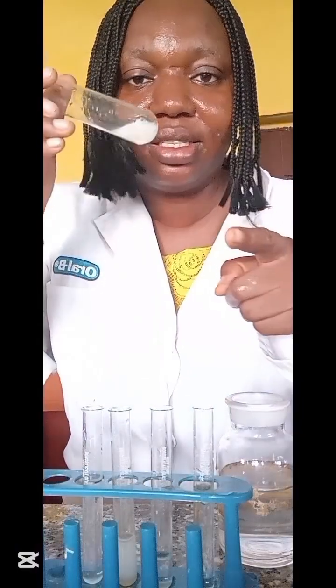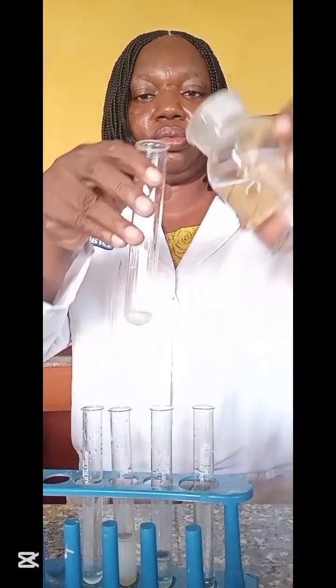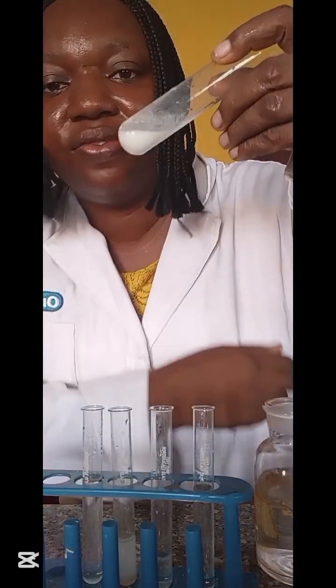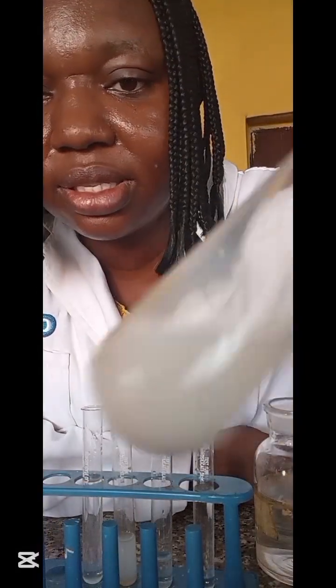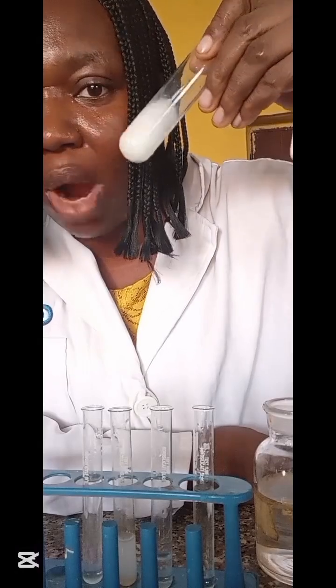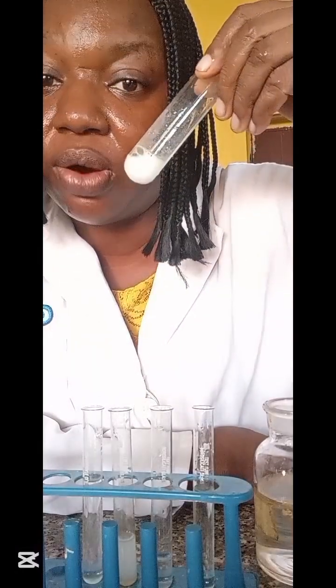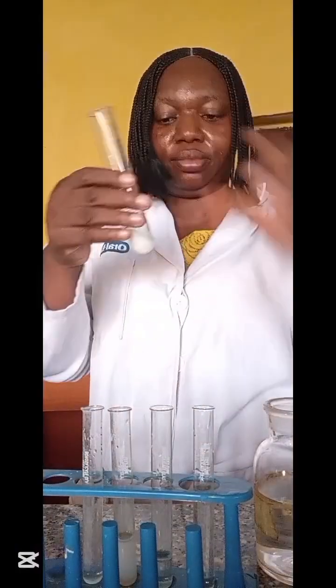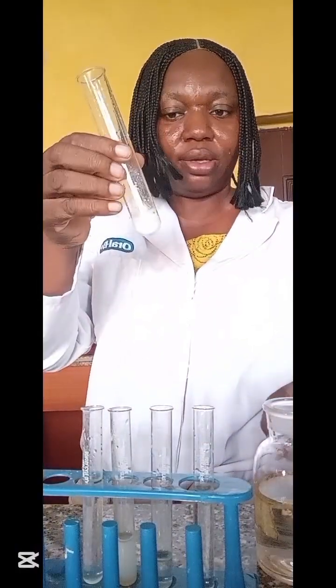Now let's go to the powdery ones. This is a lead solution. You see? Very different. This one is white. It's different from that one that was jelly-like. Look at it, powdery.